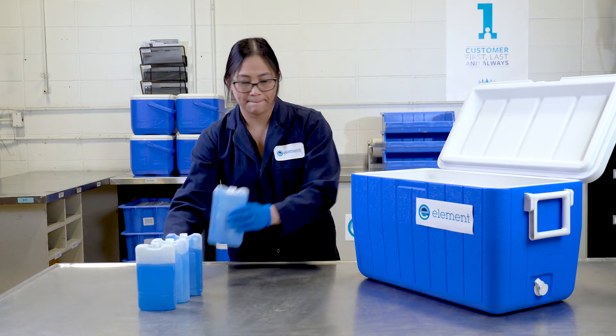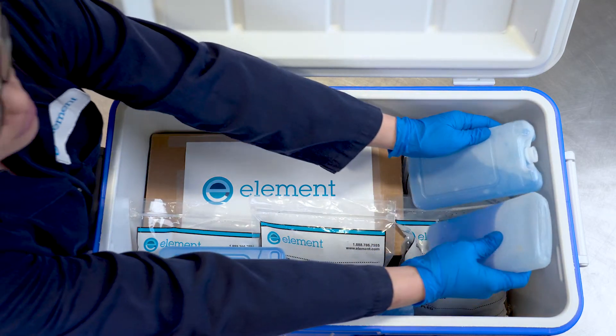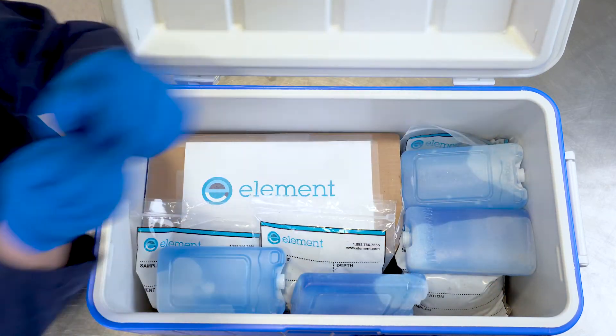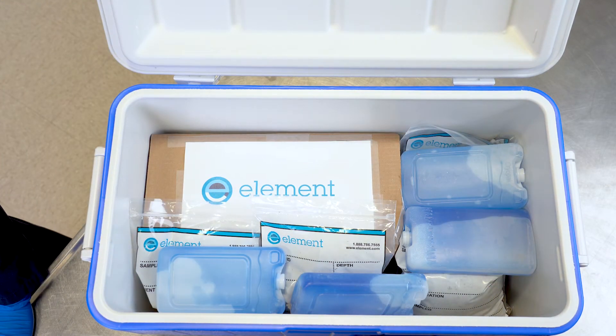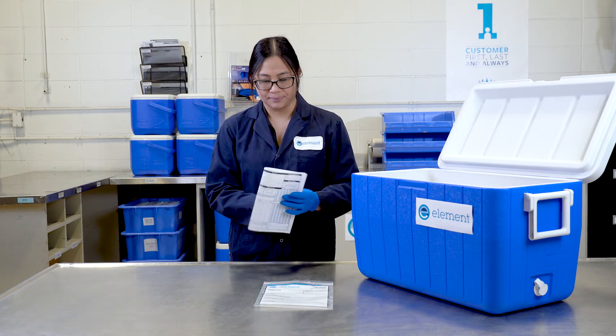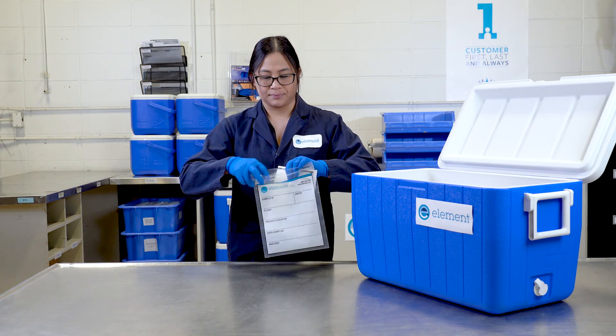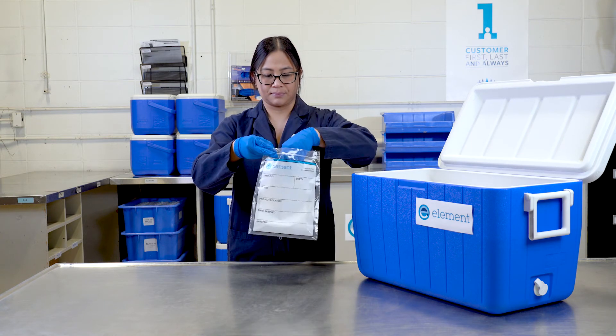You can add ice packs if you like to make sure the samples are not overheated. Hydrocarbon samples should be maintained at 4 degrees Celsius. Don't forget to include a chain of custody form. It's best to put the chain of custody form in a ziplock bag to ensure that it is not damaged by moisture from the cooler.